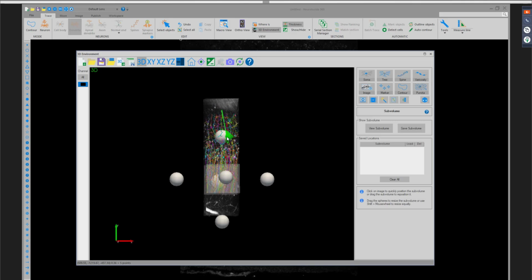It's nice because it allows you to have that flexibility of keeping the different settings and regionalizing them. So in the above region, where the somas were a little less saturated in staining, we can always raise the sensitivity for that soma detection. And vice versa, when we're in a more heavily saturated area, we can lower that sensitivity. But to directly answer the question, when you're working in a subvolume and you continue on to a separate subvolume, the algorithm is not going to automatically do that for you. It is going to require you to click and go through.